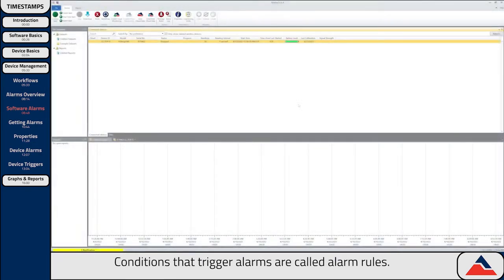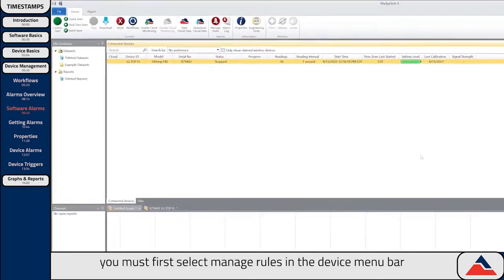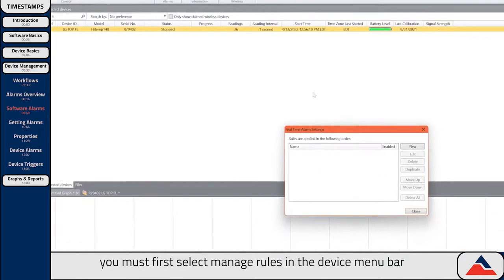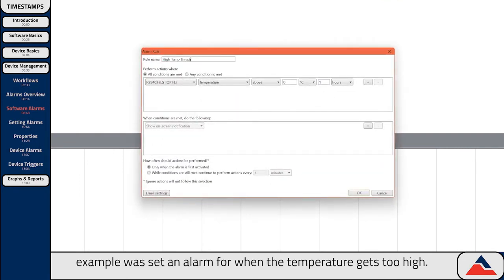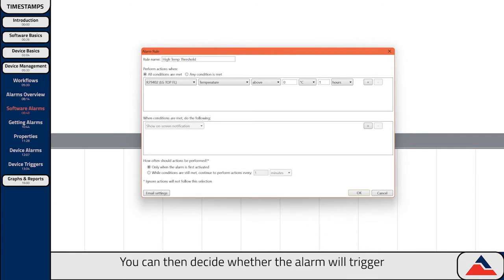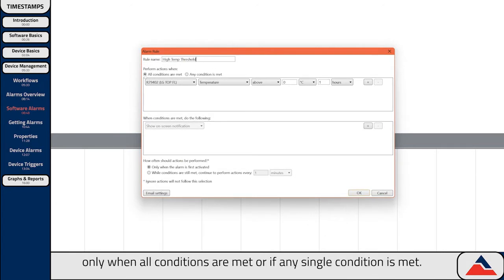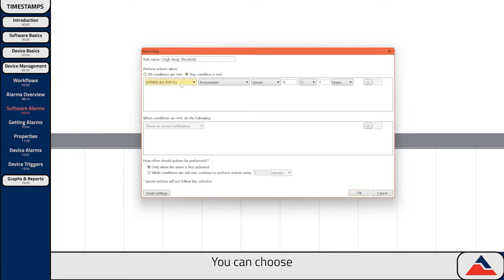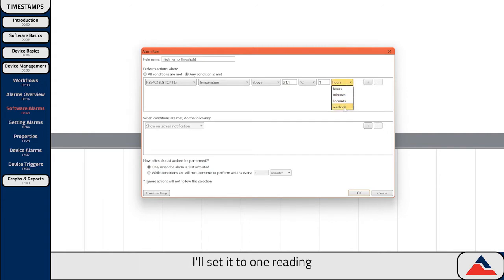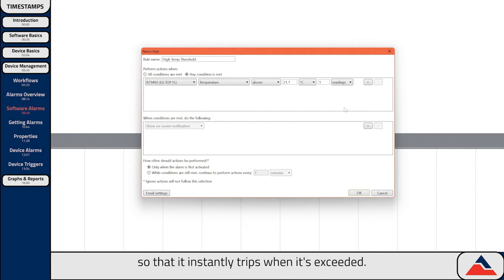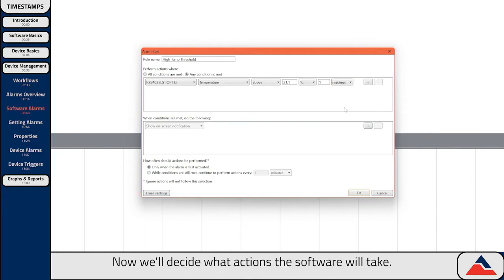Conditions that trigger alarms are called alarm rules. To add an alarm rule, you must first select Manage Rules in the Device menu bar, and then click New. First, enter a name that describes its purpose. For this example, we'll set an alarm for when the temperature gets too high. You can then decide whether the alarm will trigger only when all conditions are met, or if any single condition is met. Now we'll choose those conditions. You can choose what devices this alarm applies to, the type and value of your threshold, and the duration that the threshold must be exceeded before tripping the alarm. So if we wanted our alarm to be instantaneous, I'll set it to one reading so that it instantly trips when exceeded.